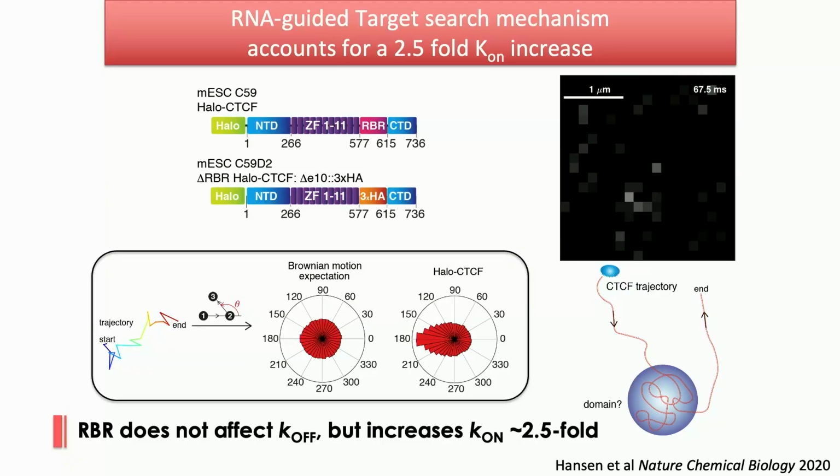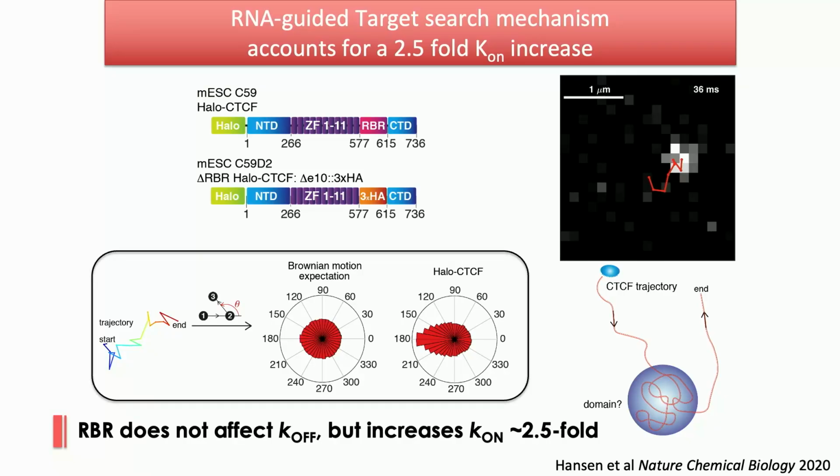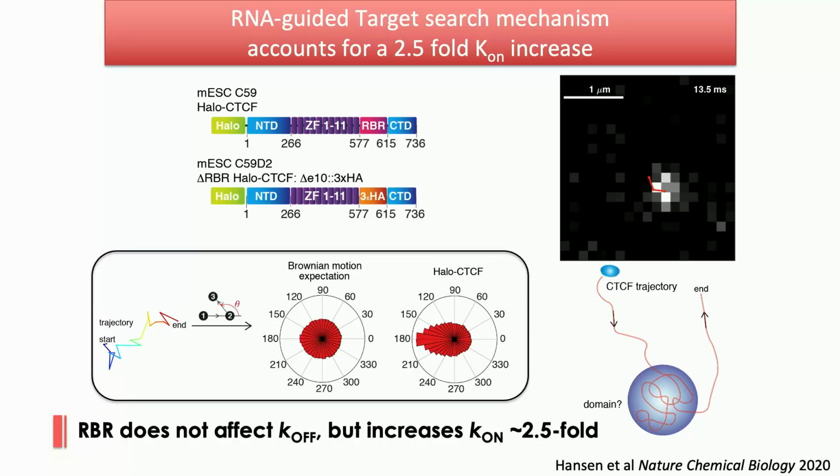And when you see this trace, for someone who is really used to seeing single particle tracking, there is something weird: it looks like it's moving. It's clearly not binding on DNA because it's moving more than that. But it looks like it's trapped in a small domain. And so Anders was a little bit puzzled by this. A long story, very, very short.